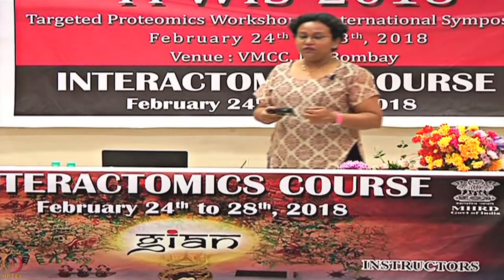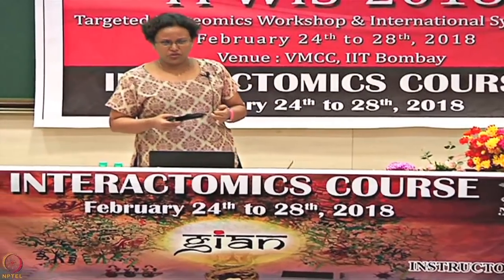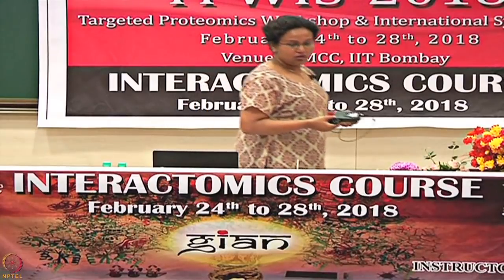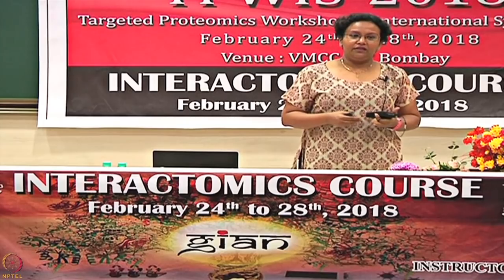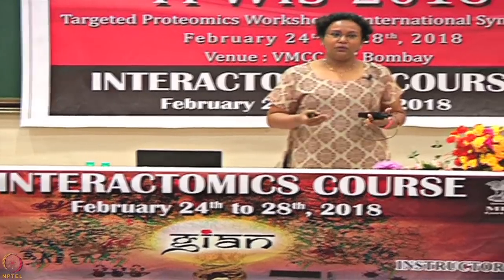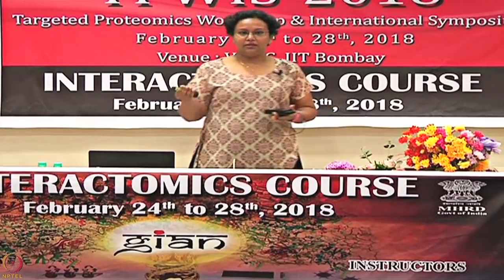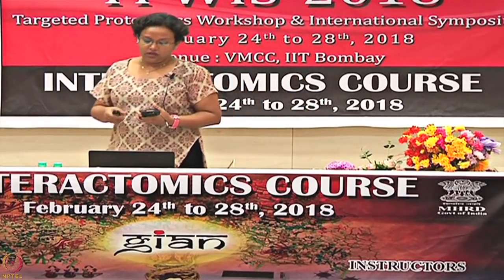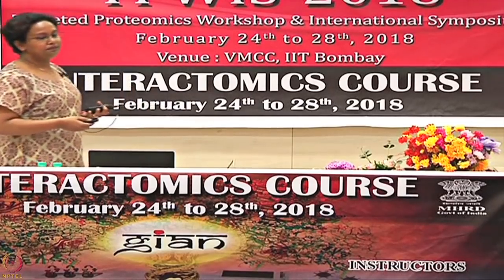If you get 600, then since your theoretical Rmax is usually higher than your experimental Rmax, if it's 600 from your theoretical, I would go ahead and immobilize 700 or 800 to compensate a little bit, and then start your experiment.